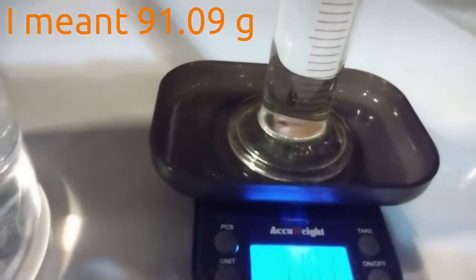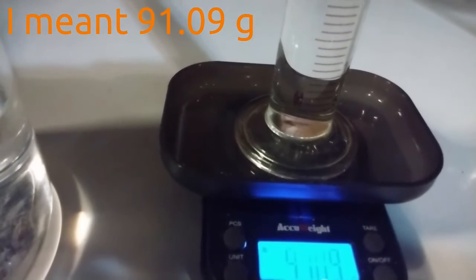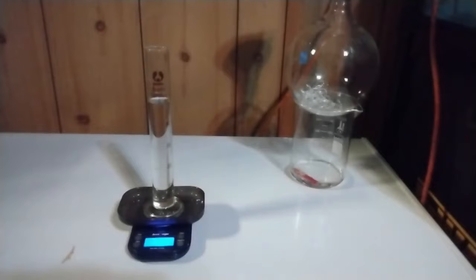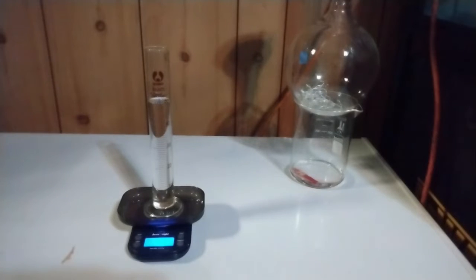The reading is 99.09 grams. So 99.09 divided by 50 gives a mass density of 1.82 grams per milliliter. If you look online, the mass density of pure 98% sulfuric acid is 1.83 grams per milliliter — so we are very close. This is a good indication that what we have is really concentrated sulfuric acid. That was our second test.